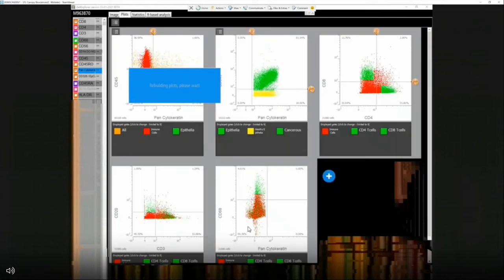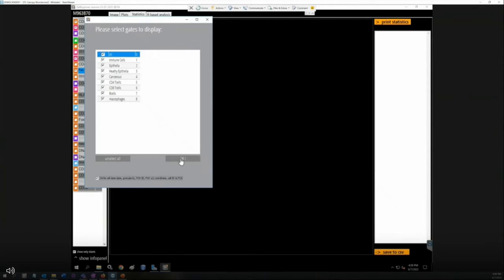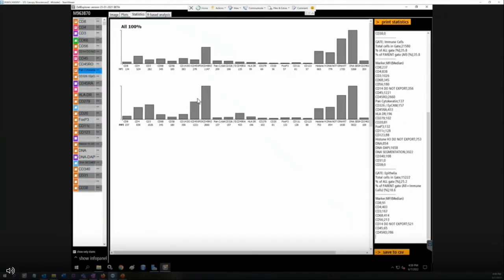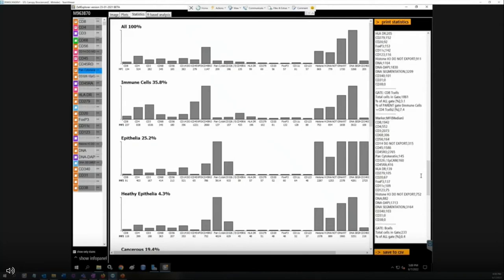Once we've done an analysis we're happy with and come out with individual populations, the next step is exploring those results. The first way: if you're truly just interested in the internal pipeline and want to export phenotypes, the easiest way is to just print statistics. Select all gates, write all the metadata, and you can immediately get descriptors about the populations you've demarcated — the gate designation, total cells in the gate, percentage of the all gate, and percentage of the parent gate.